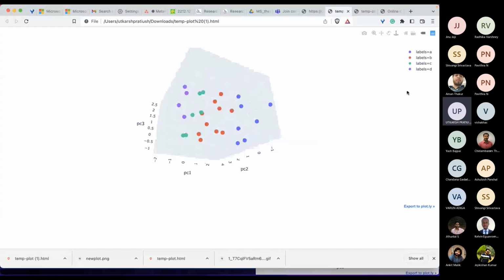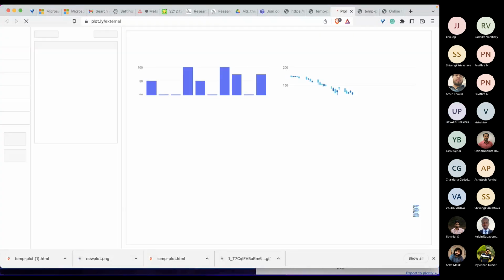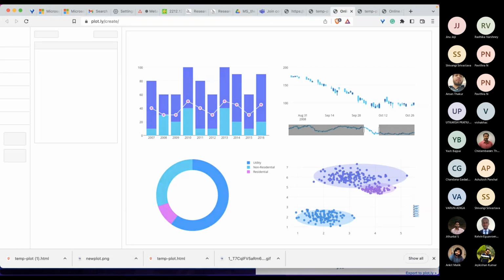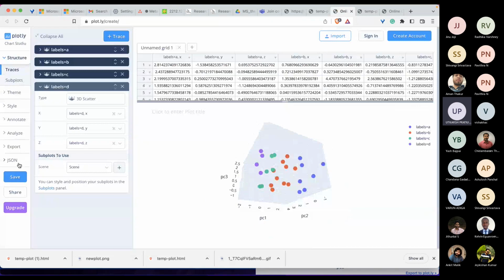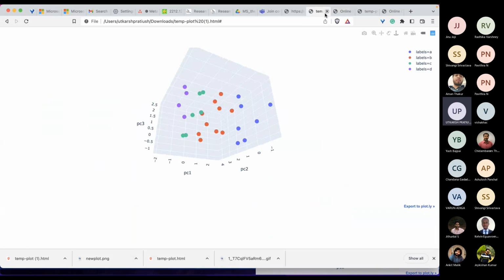It can be whatever lines you have. Similarly, you can export this as well, and go ahead with post-processing. After doing this, you can just delete the HTML files if you wish.